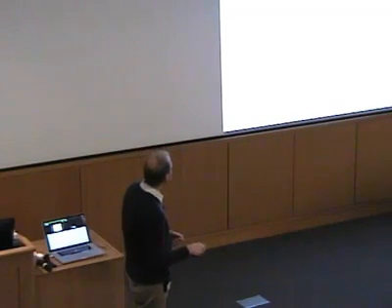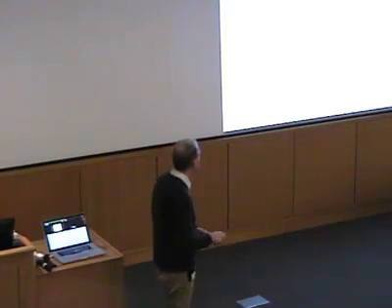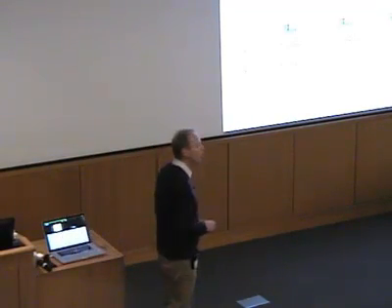Right? And we can continue that game, go to a different orientation, and the lines all move and so on. And here we've gone now through 90 degrees rotation. So if we take all of those data, then we get this rather complicated-looking set of rotation patterns.